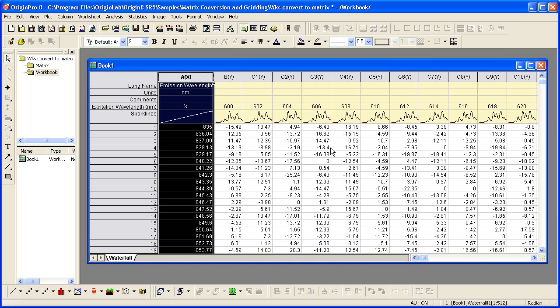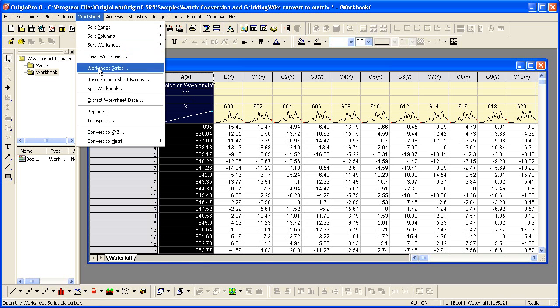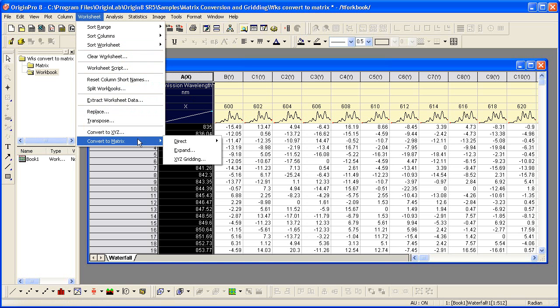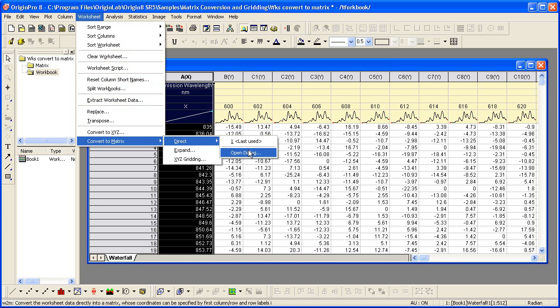With the worksheet active, I select the worksheet menu, convert to matrix, direct. The data is already set up in a matrix form, so we just need to do a direct conversion to the Origin matrix.